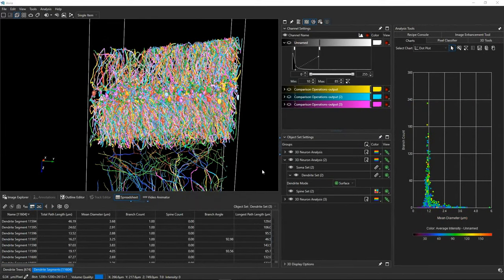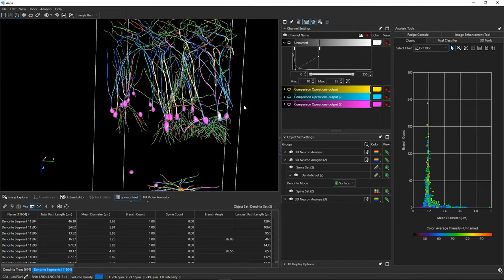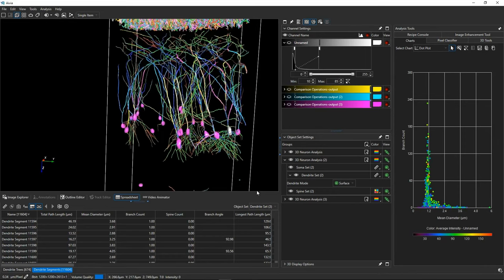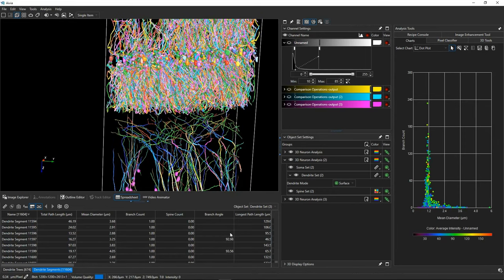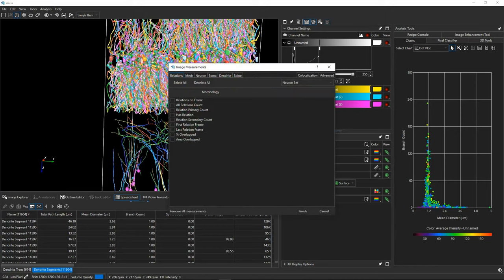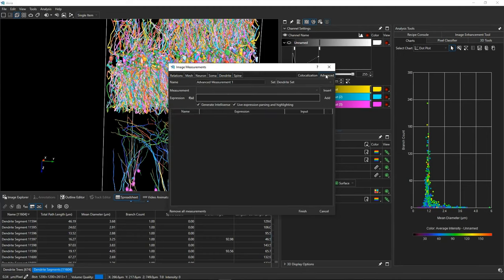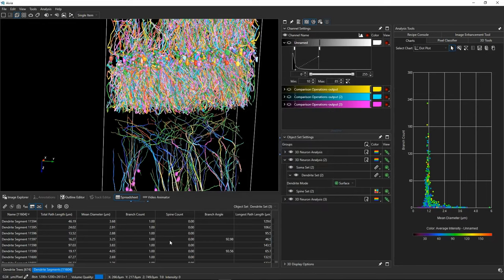Once all tracing is completed — either using an automatic recipe or the predictive tools — you have access to a wealth of measurements calculable from these object sets. If any measurement is missing it might be toggled off, and if still missing you can write your own measurements that will run inside Avia. Results can be viewed as a spreadsheet — exportable to Excel — or as embedded charts in Avia.